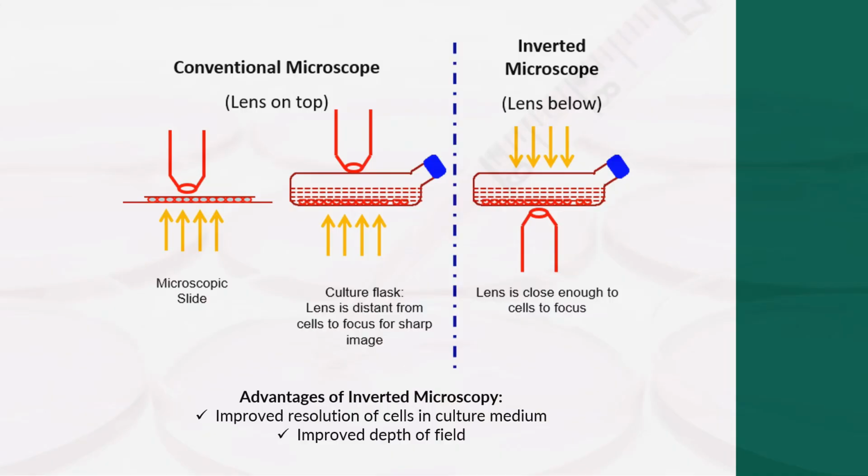Okay, and because the inverted microscope in cell culture applications allows us as scientists or researchers to observe cells in a more natural and very undisturbed environment. The cells can be cultured directly at the bottom of the culture dish or on a cover slip, and it allows for very easy access or manipulation of the cells during experiments. So you can literally have an inverted microscope in a biosafety cabinet and manipulate your cells on the microscope. Okay, so the design is very suited.